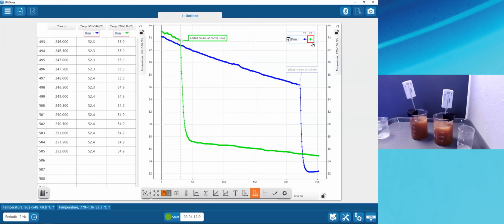So I'm going to note that I have the green measurement active, and I'm going to come down here and introduce a new tool. It looks like a little crosshairs, and it's called the coordinates tool. If I add the coordinates tool with the green measurement active, you'll see that it adds what looks like an annotation, but the beauty of the coordinates tool is that as I move it around, the annotation automatically updates to show me the X and Y coordinates of the point inside the gray box here.